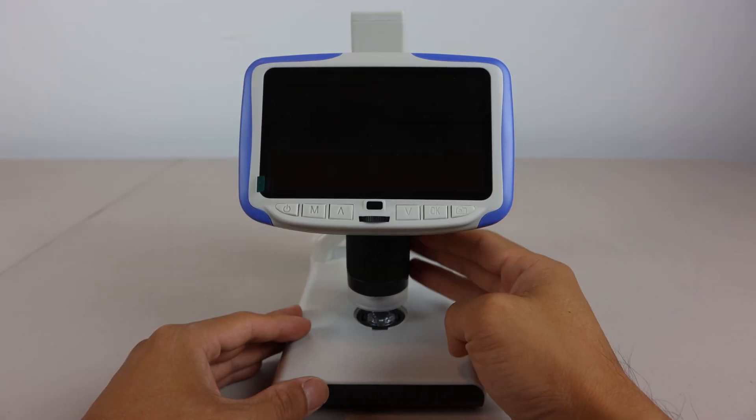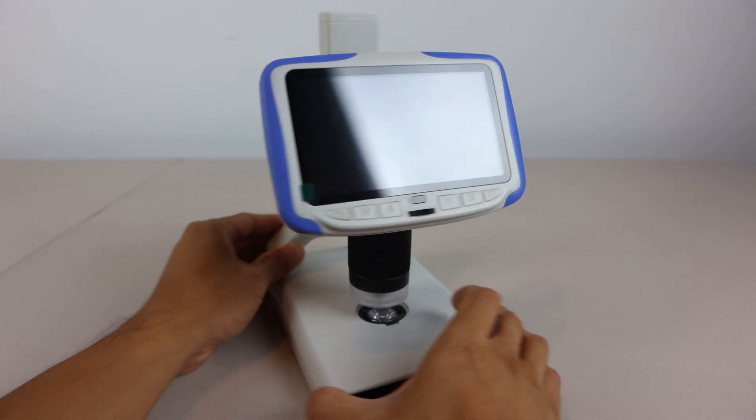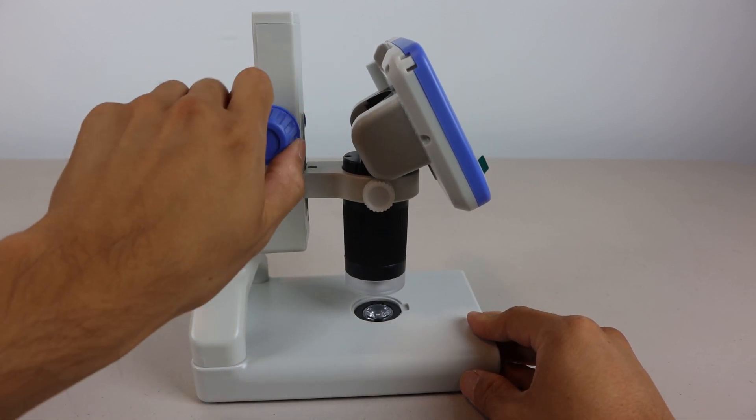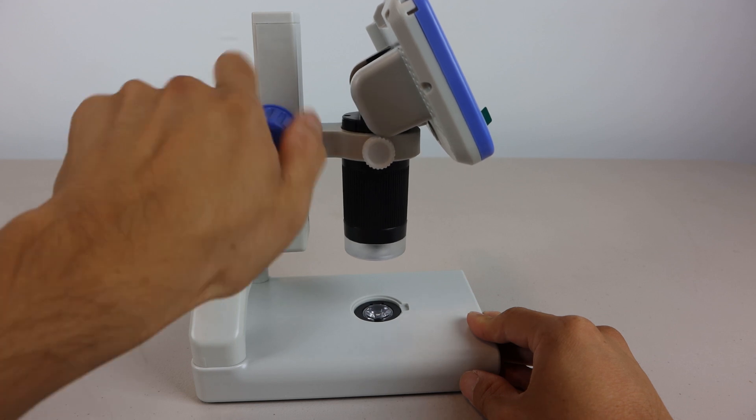Just under the screen, this black tube is the focus controller for the lens. The large blue knobs control the height of the lens, which can move up and down about 2 inches.